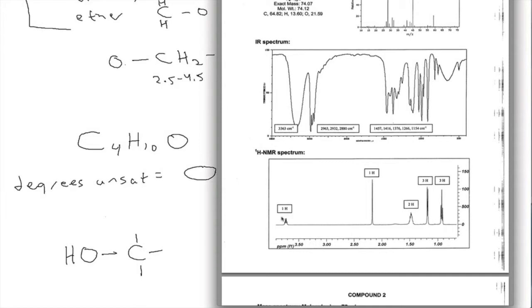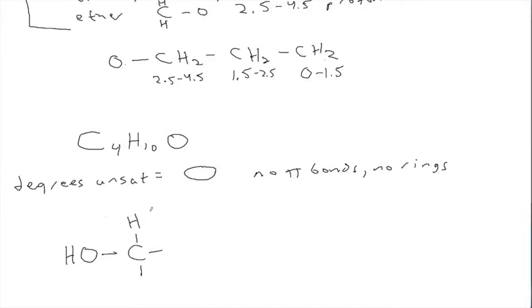There's no other possible reason for that hydrogen to be shifted so far to the left when there's nothing but this oxygen in here. So now looking at that peak, that tells us how many hydrogens are on this carbon. 1. That's right, 1 hydrogen on that carbon.